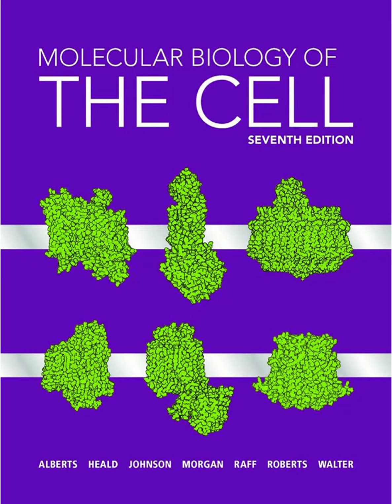Two key breakthroughs. First, sample preparation. You take a purified sample of your macromolecule, like a protein complex or virus, apply a tiny drop to an EM grid, blot away most of it to leave a very thin film, and then plunge freeze it incredibly fast into liquid ethane. Vitreous ice again, preserving the structure without crystals. Exactly. The molecules are trapped in random orientations within this thin layer of non-crystalline ice. You keep the grid frozen at liquid nitrogen temperature inside the microscope.